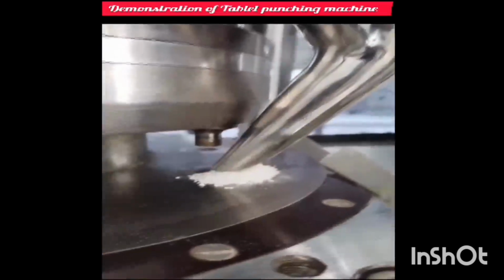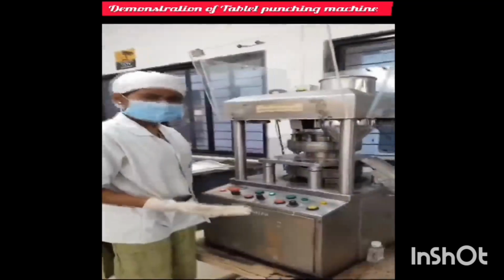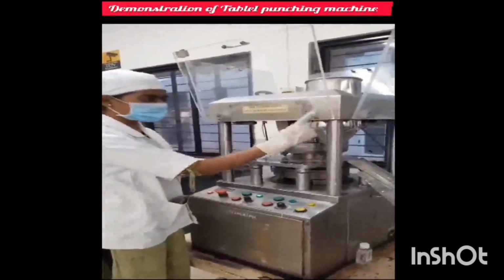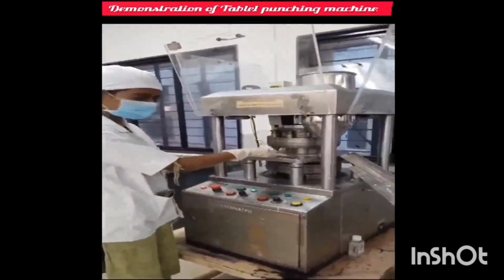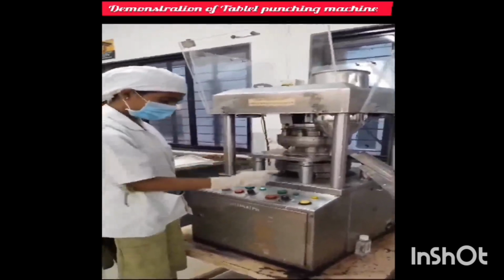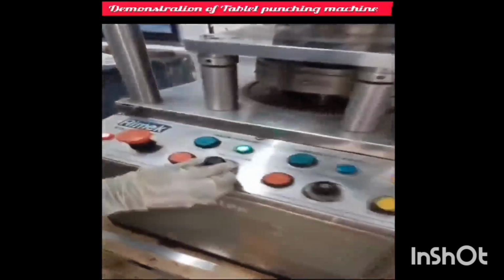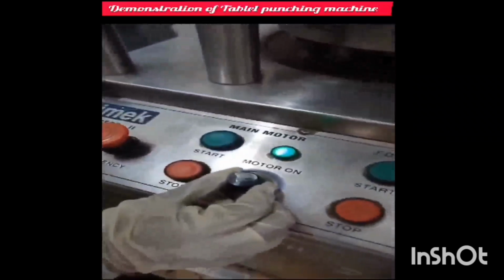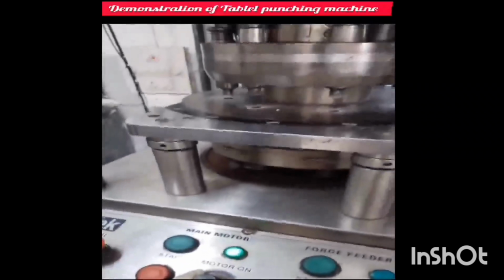The feeder will get passed through this and it will go into the dies. As we have already fed the feeder into the hopper and passing down, it has got collected into the dies. Now we will start the actual process for compression. Now the dies and punches rotation will be managed by adjusting its speed. After adjusting the speed, we can see the dies are moving.